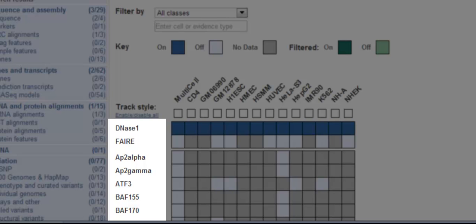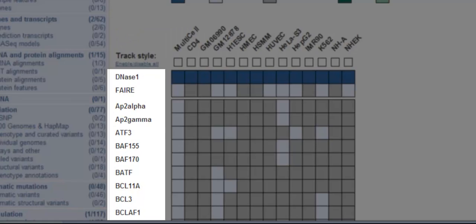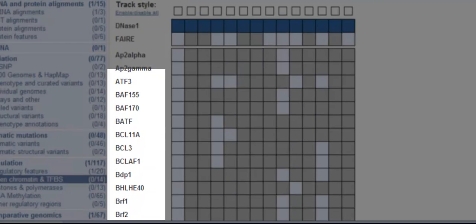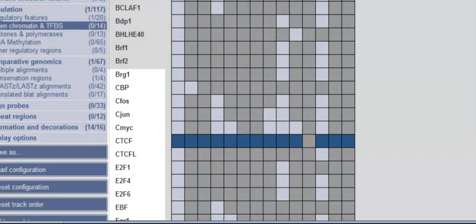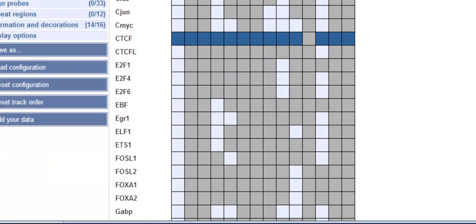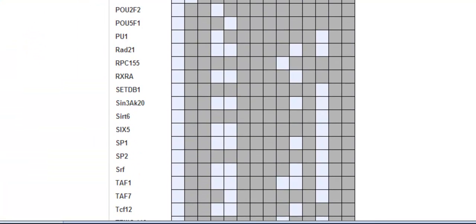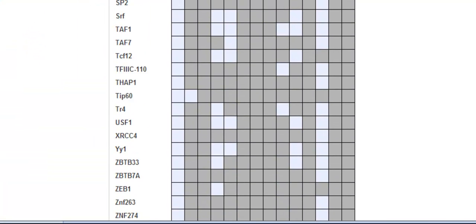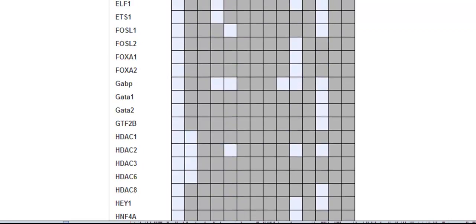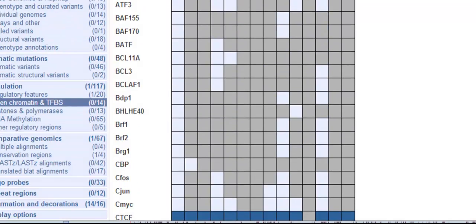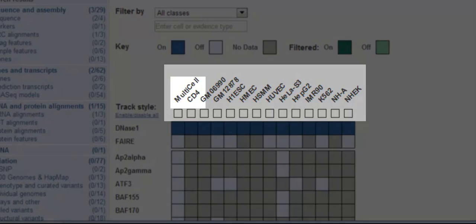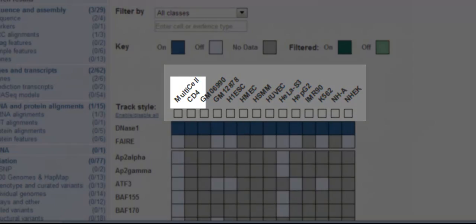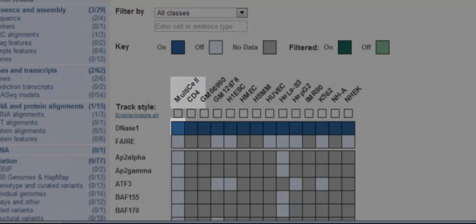Now back to the matrix. The y-axis shows indicators of open chromatin, DNase1 hypersensitivity and FAIRE binding, and different transcription factor binding sites. Along the x-axis, we have different cell types and a multi-cell option that brings together the data for the single cell types.